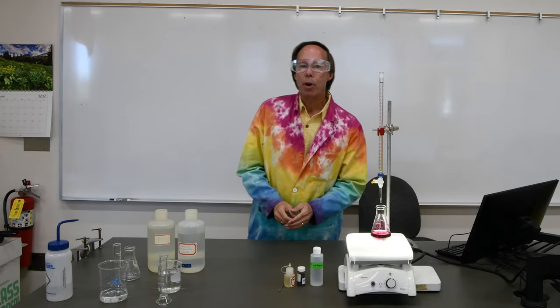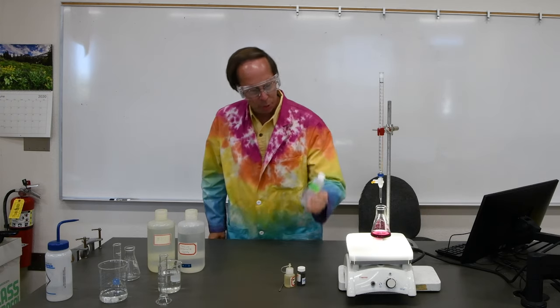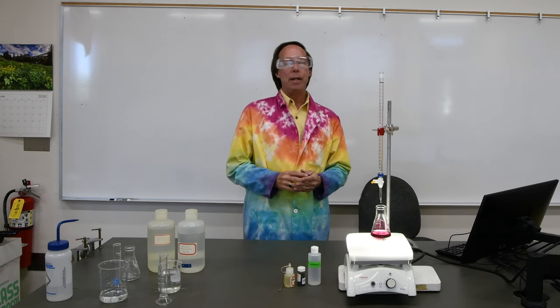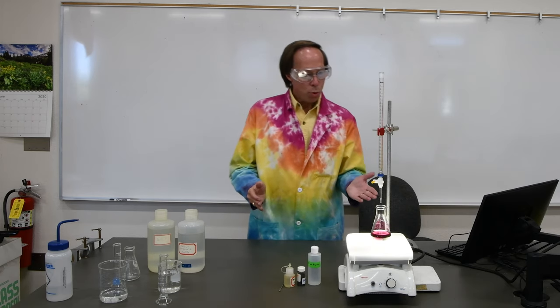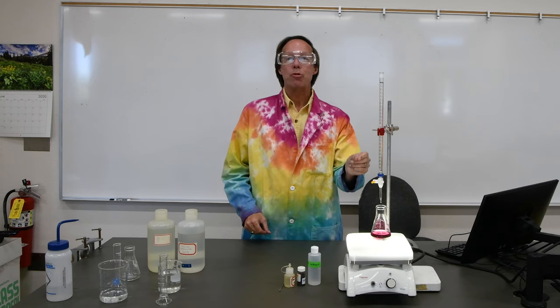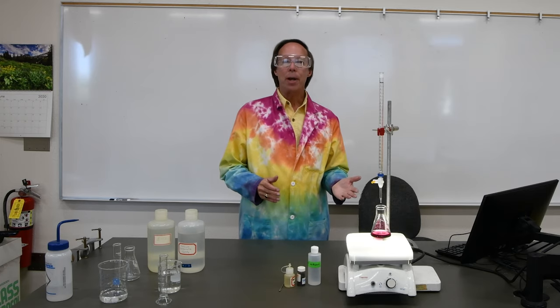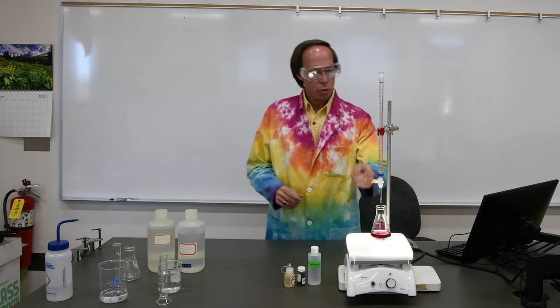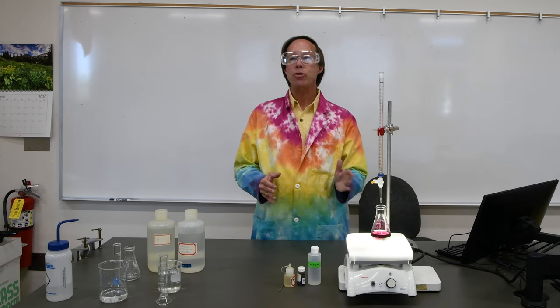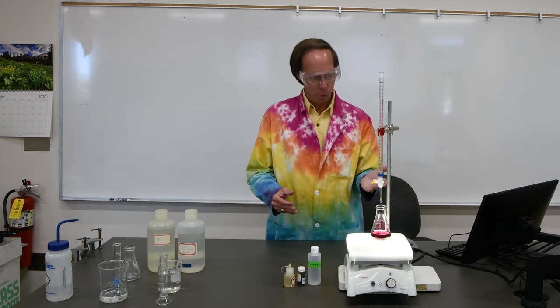Now that we've completed our two trials of the known calcium sample, it's time to test an unknown. So we have an unknown here. And in this case, we really don't know how much EDTA is going to be required. So there's two ways you can approach this. Number one, you can add one drop at a time slowly until you reach the endpoint, but that could take a very long time. The other approach is to do one sort of quick and dirty titration just to get an idea of where it's going to change, and then we'll go back and do two trials very carefully. So I think we're going to use the latter approach here.